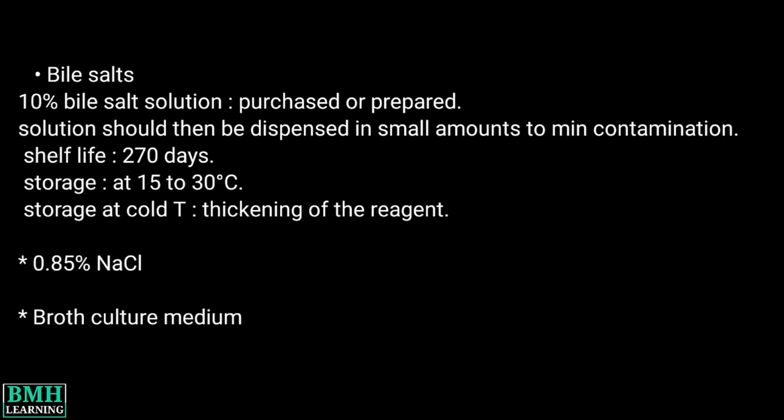The shelf life of the solution is usually 270 days. The storage should be done at 15 to 30 degrees centigrade. The storage of the reagent at cold temperatures might result in the thickening of the reagent. 0.85% NaCl. Broth culture medium. You can use BHI.